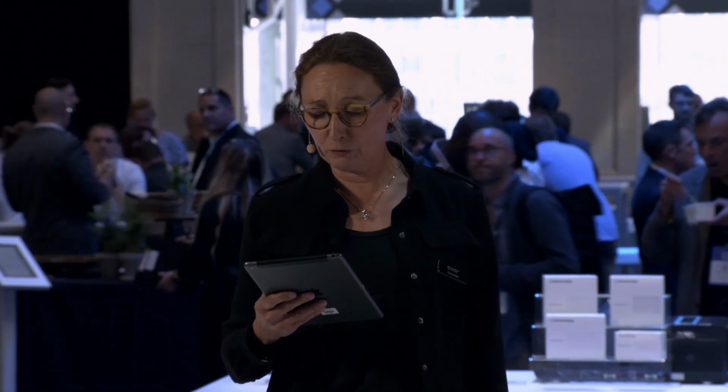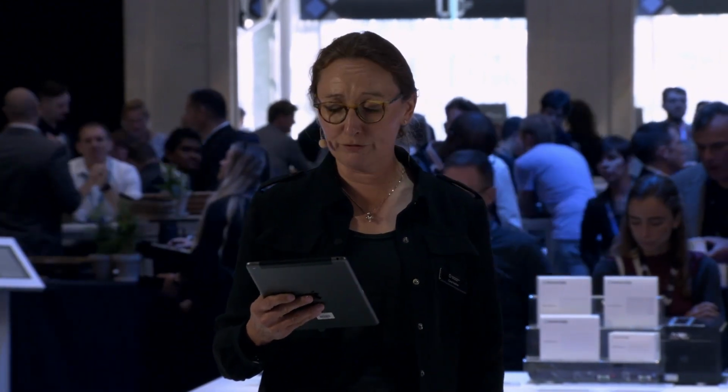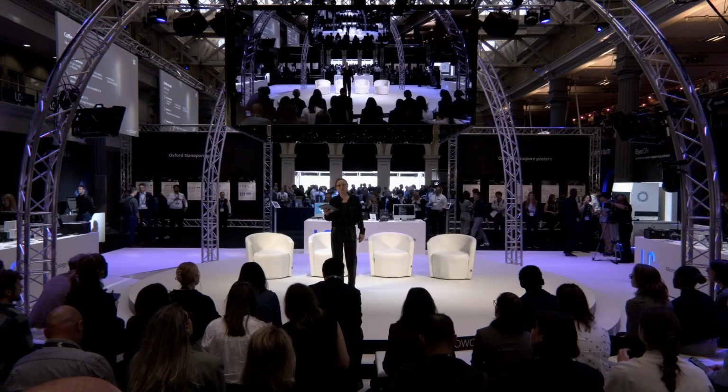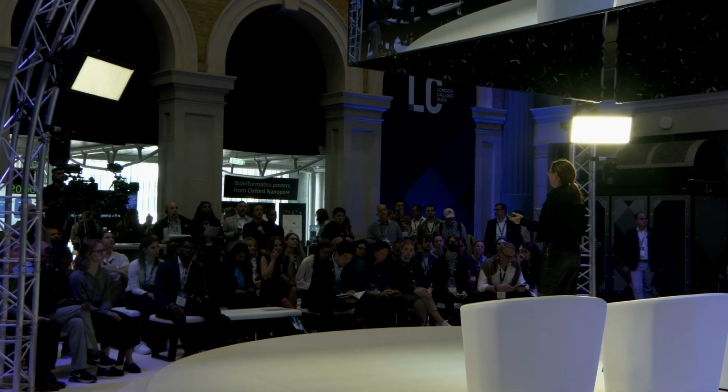I will introduce the speaker in a few moments, but first, I wanted to present a brief overview of the real-life example that Oxford Nanopore is doing for complex disease and the solution we have for large cohorts. Understanding the genetic architecture of complex disease has always been a numbers game.